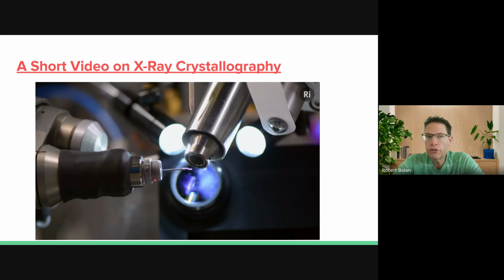I want to play a real short video on X-ray crystallography so you can see how this all works in action. This was a video taken from another beamline, the Diamond beamline, I believe, over in Great Britain.